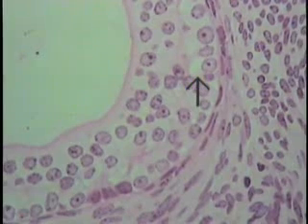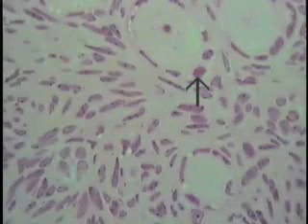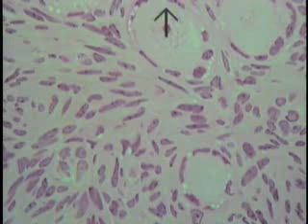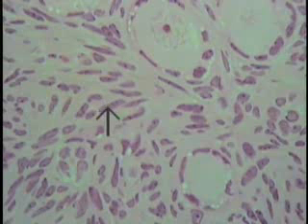Having done that, go to an example that is perhaps even a little bit more difficult. If we retrace our steps and go to where we began our observations, this entire field is comprised of cells closely packed together. This is the initial oocyte that was examined, showing very clearly the approximate region of the nuclear envelope, the nucleus, nucleolus, and then cytoplasm going out to about this, where the tip of the arrow is indicating. These are nuclear profiles of surrounding cells.